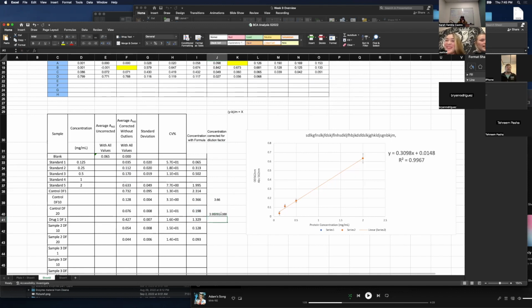Yeah. And so if your formula is done right and your samples are consistent, these should be the same number, because if they all fit within the linear curve, the absorbance versus concentration should fit the linear curve. And so that's basically it.